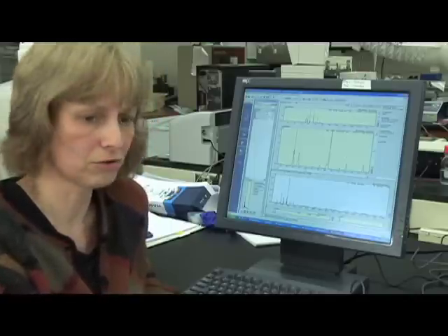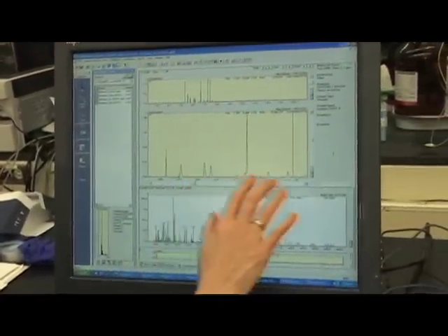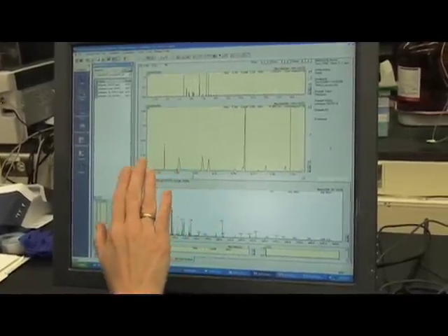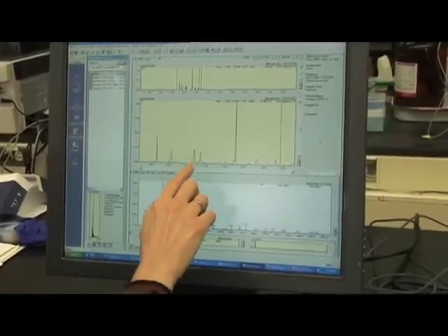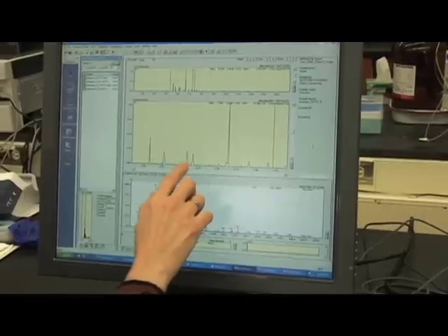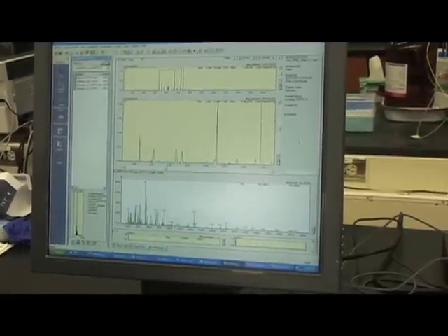And if we have a closer look at the chromatogram, here you see in a close-up a gas chromatogram as it is developed by the mass spectrometer. Every detector in chromatography will give an output of so-called peaks, as you can see here. And these peaks represent the different compounds that are coming through the column and that are running through the detector.